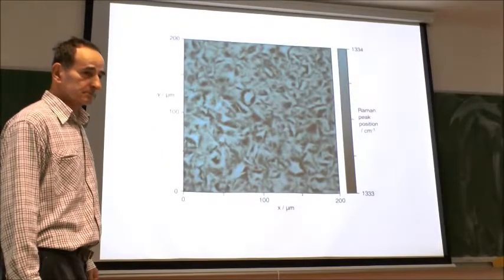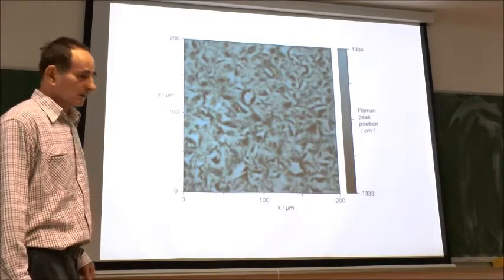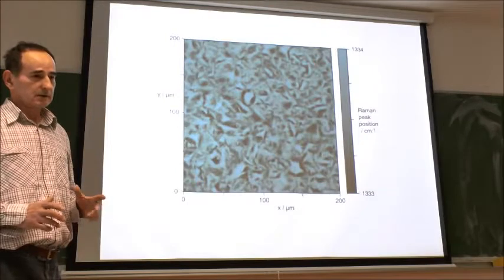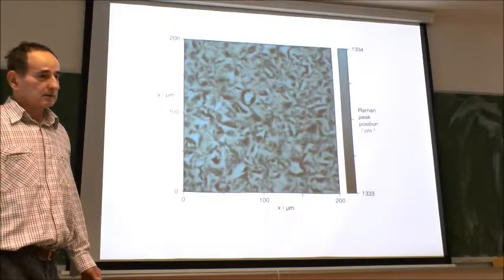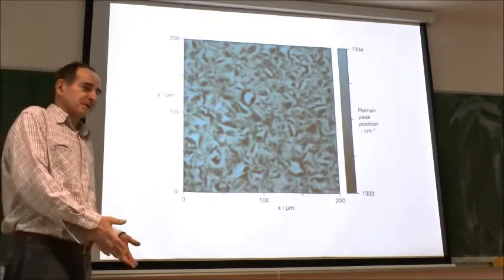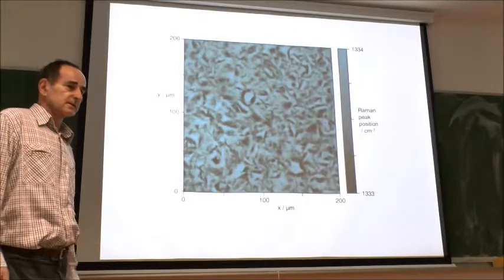What is the maximum sample size that can be examined? Say, can I, for example, scan the surface of this notebook? Not exactly. It should fit under the optical microscope. So it cannot be moved up, for example. Well, there is some space, but you cannot bring the card. So we are talking about millimeters or centimeters? There are centimeters.